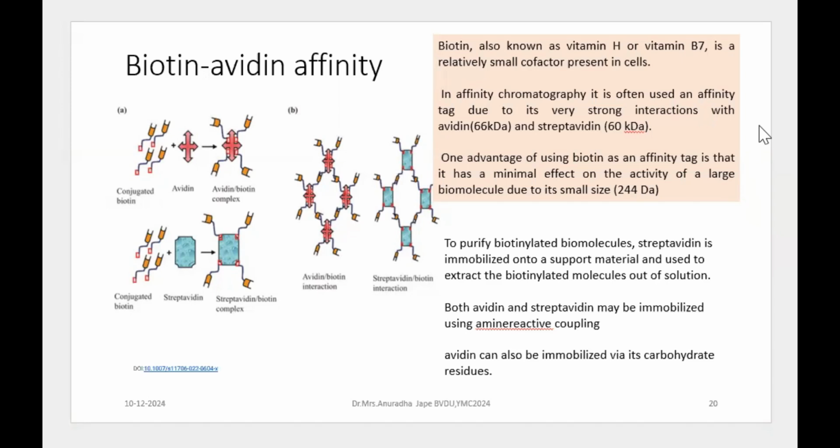So it is essential that the ligand has a suitable chemical group, a functional group, a group of interaction sites that will be involved in reversible binding of the ligand. It should not be irreversible, not at all. It should be reversible binding, and once the analyte is attached to the ligand, it should be extractable.